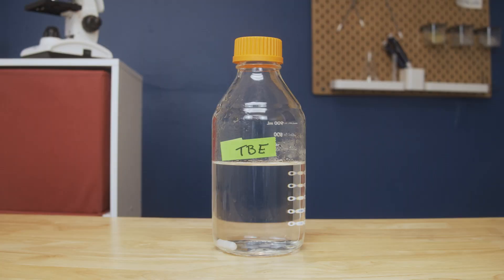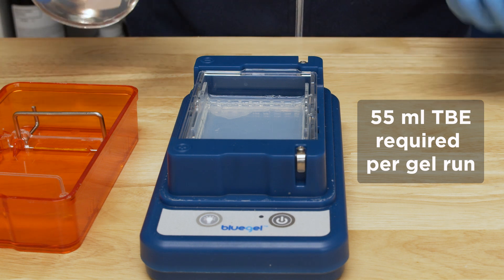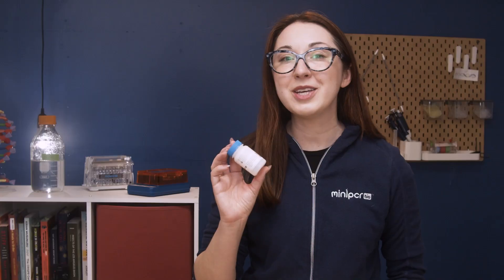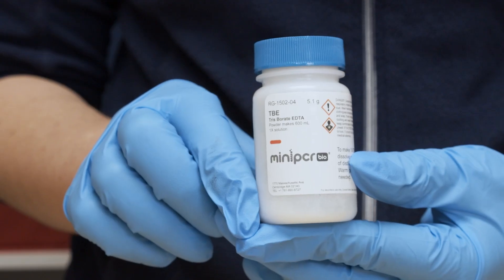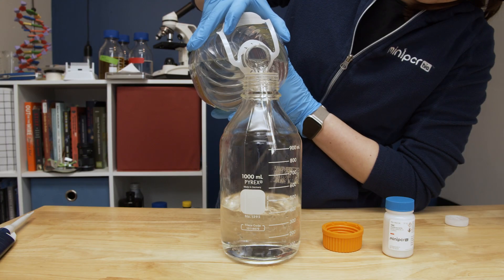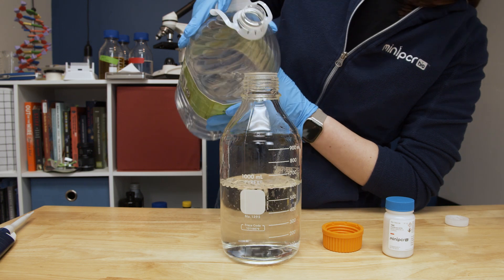First, you'll want to ensure that you have an appropriate quantity of TBE buffer to run and pour your gels. You will need 25 milliliters of buffer to make each gel and 30 milliliters of buffer to run each gel. TBE powder from MiniPCR Bio makes buffer preparation simple. For most classrooms, the 5.1 gram container of TBE powder, which makes 600 milliliters of TBE buffer — enough for 10 blue gel runs — is sufficient.